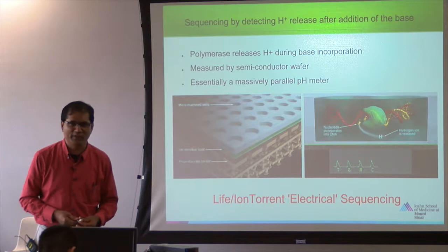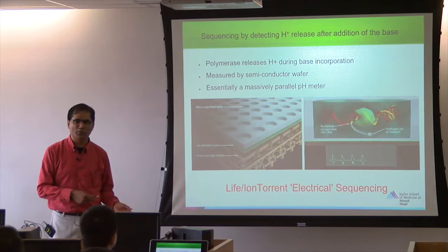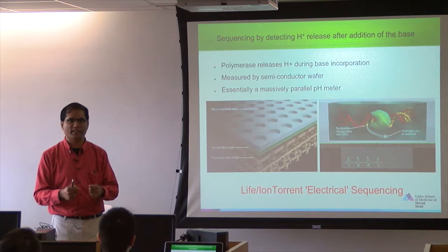Okay, what was the second human genome which was sequenced? Anybody knows? Whose genome was it? Watson, yeah, Watson's genome was sequenced using the 454 machine. They showed that we can use this next generation sequencing technique to sequence another human genome.